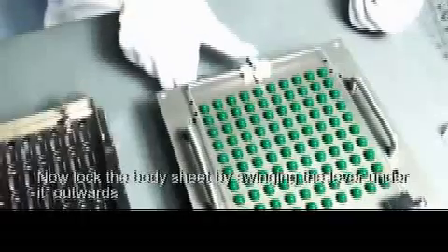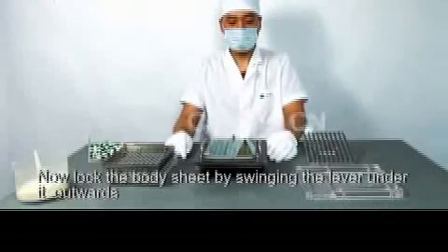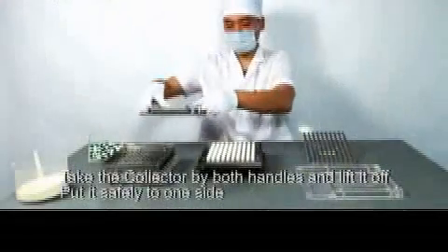Now lock the body sheet by swinging the lever under it outwards. Take the collector by both handles and lift it off. Put it safely to one side.